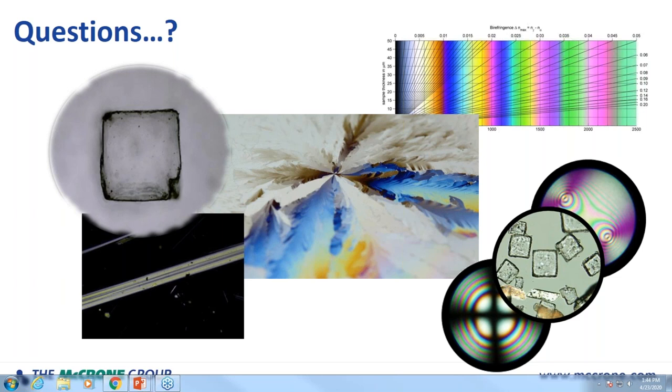If you get above 6, 7, or 8 different particles, it gets to be time-consuming and challenging, but it can be done. One of my colleagues here at some point was asked to reverse engineer a mix for a food company, and I was involved in that. He came up with 8 different particles, and he got it all done. So once you have the different particles identified, you would isolate those particles if you can, and then run through this mix right away.